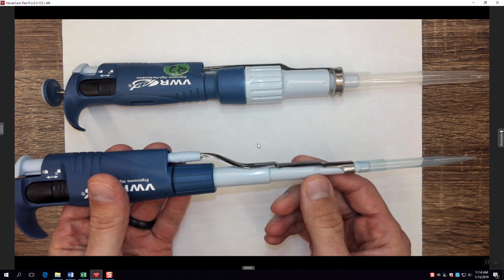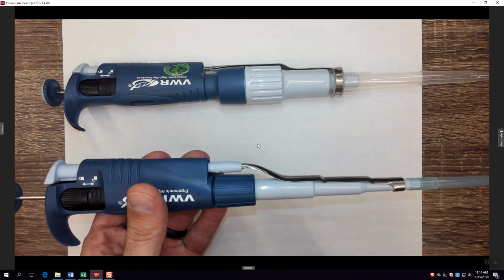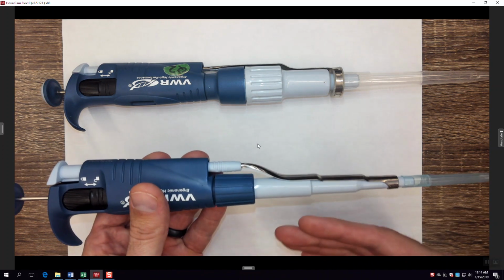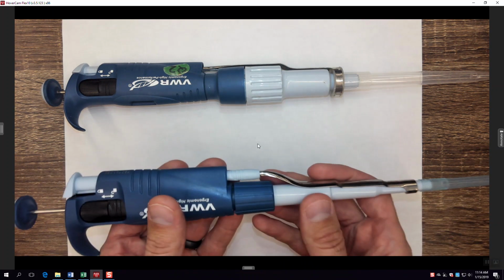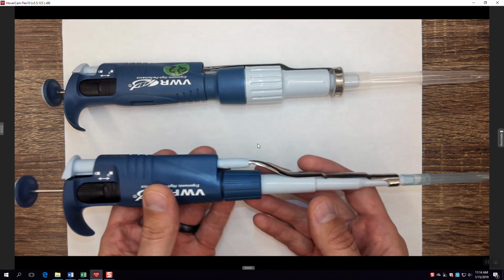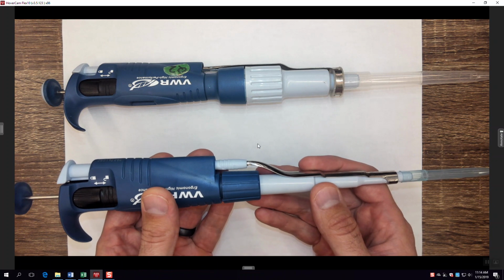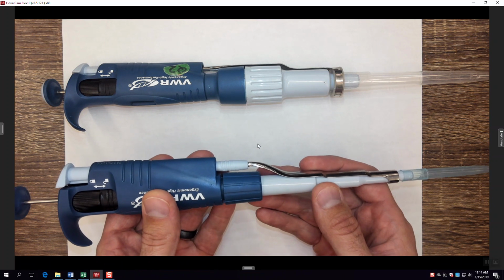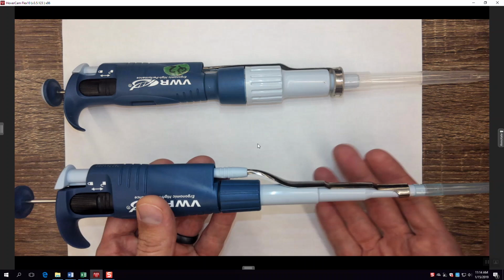So what you're going to do is you're going to use 3 different types of common measuring devices in chemistry labs. And maybe you've used these types of pipetters before, and maybe you haven't, but these are basically the VWR's version of an Eppendorf pipette. And here we have one that will measure from 0.1 milliliters to 1 milliliter. We also have one that will measure from 1 milliliter to 5 milliliters, and these are the common volumes you're going to use in this course.